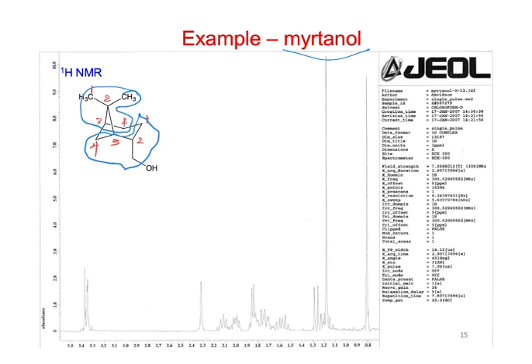Okay, so we'll walk through these next time. And then what do we have? I think after that, we'll start working. Oh, we still got a few things to do with HMBC, and then the INADEQUATE, and then we'll work some examples and stuff after that.